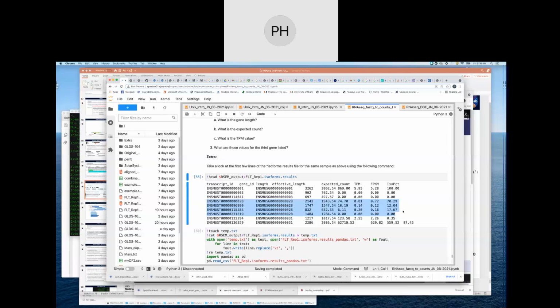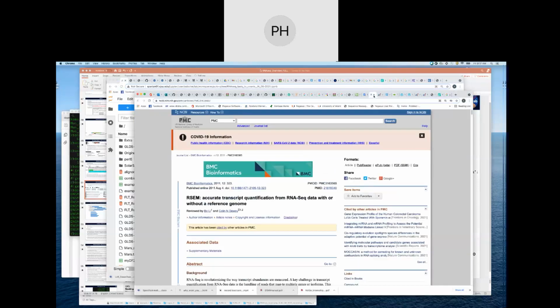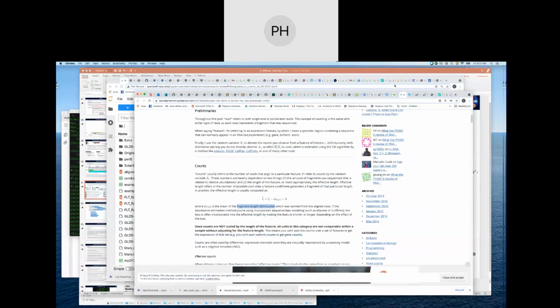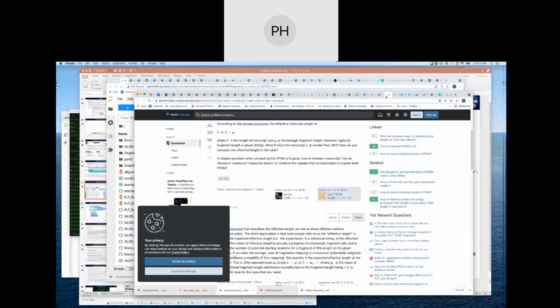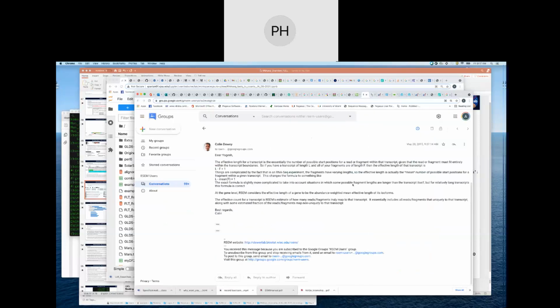Okay. And then the next column that we have is the effective length. And so this one I know kind of tripped me up for a while, and I was trying to wrap my head around it. I had it before, but I guess it's been a minute. And so kind of going back and taking a look at different blogs and different forums, I wanted to find the clearest explanation that I could. And so, which one did I like here? I think it was a Google form that I liked. Yeah, right here. So I kind of like this explanation here. So I'm just gonna take it.